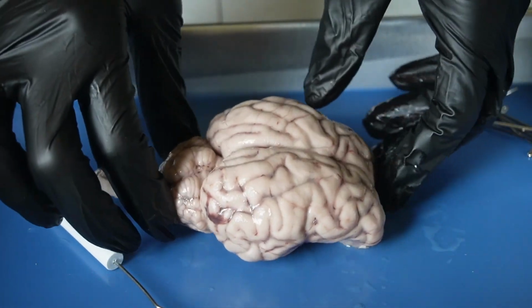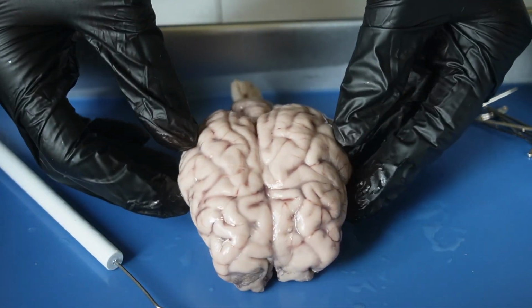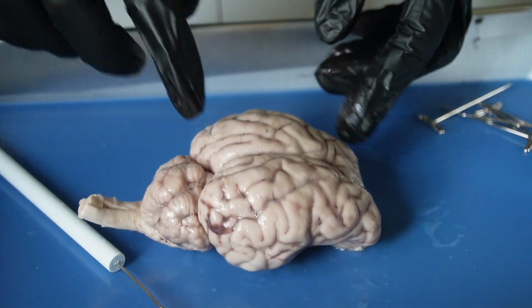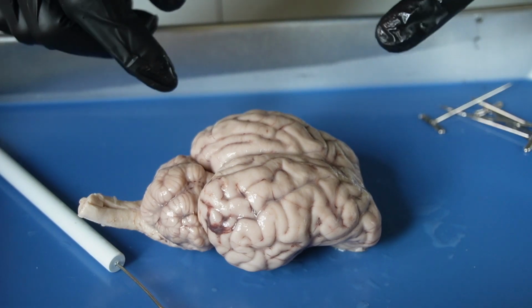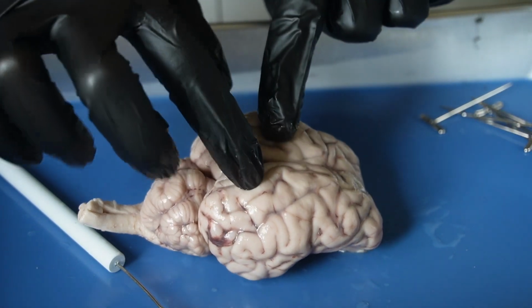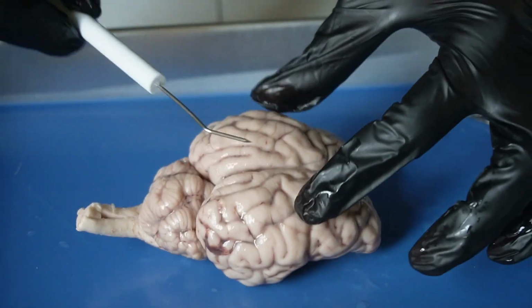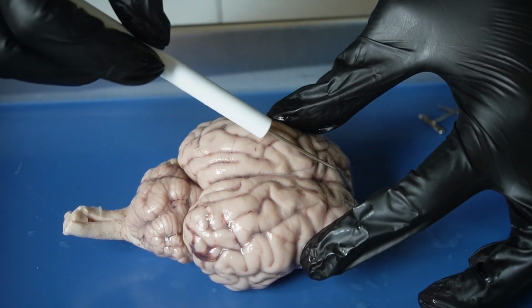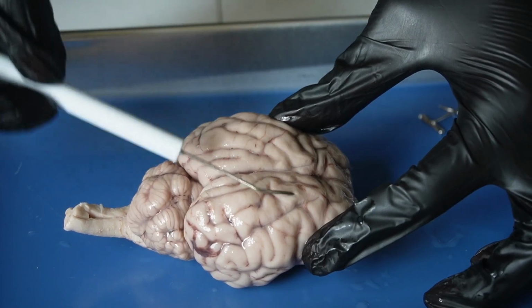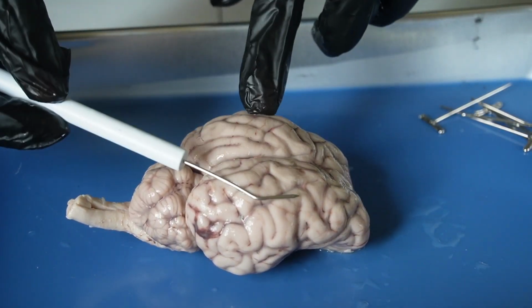The next portion of the brain would be the right and left hemispheres, which are connected by the corpus callosum, which is this middle part here of the brain, fibers that connect the two hemispheres together.